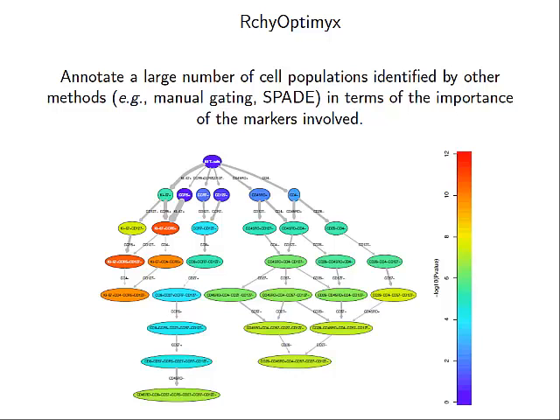So one is how different the proportions are, and how easy is it to find those differences in proportions. And you have to do both, right? If it's a rare population that's close to a big population, that's probably going to be hard to find in discovery, and so you may never find that automated. The win is that if it's a rare population, we hope it has something closely associated to it. Something like this is at least going to point you in the right area. We may not get the exact population correctly, but we'll get you close.